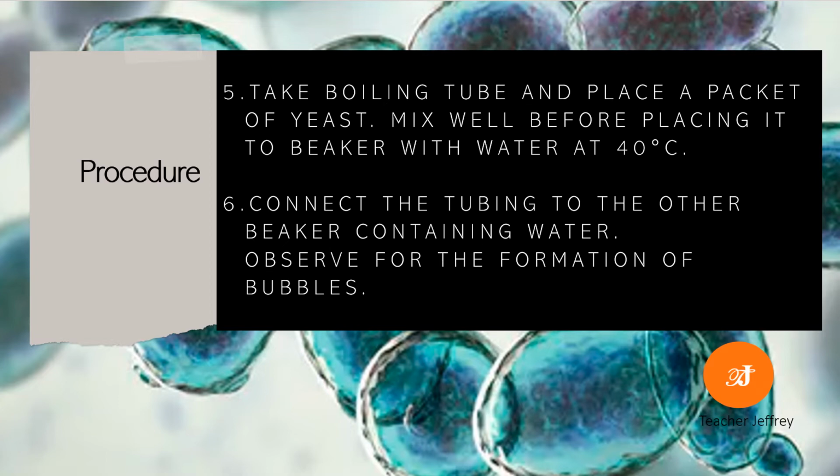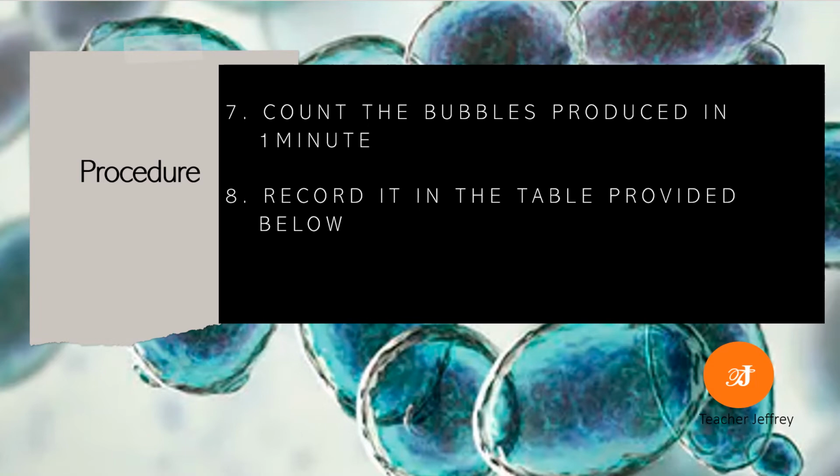Observe for the formation of bubbles. Step 7. Count the bubbles produced in 1 minute. And lastly, record your observation in the table provided below.